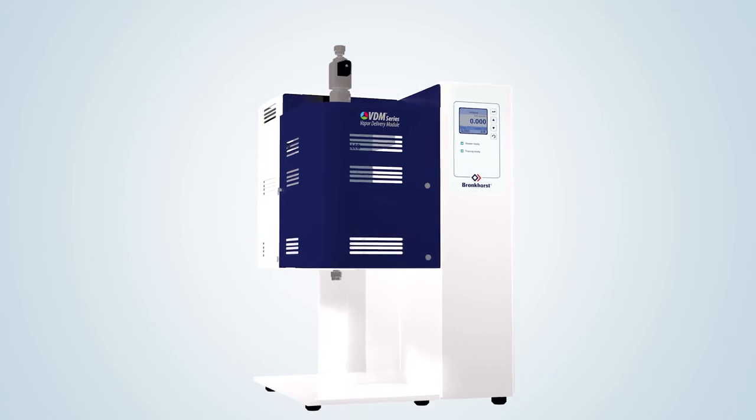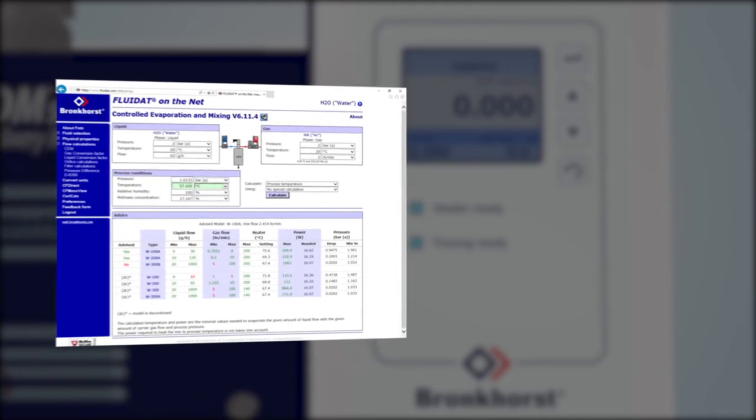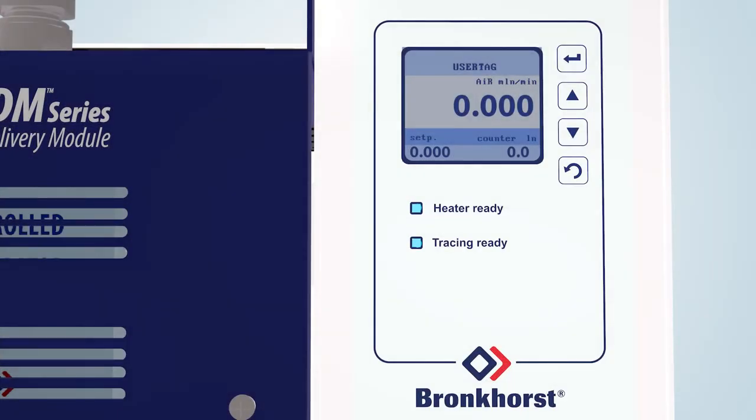On the color TFT display, the gas flow, liquid flow and temperature of the heat exchanger can be indicated. These system parameters can be changed by using the push buttons on the right side of the display. For the calculation of CEM or VDM evaporation system variables, Bronkhorst developed an online calculation tool. Customers may apply for a free registration on fluidat.com to consult this very useful software tool. The readout control panel also features alarm and counter functions and optional control for additional heat tracing at the outlet of the system.